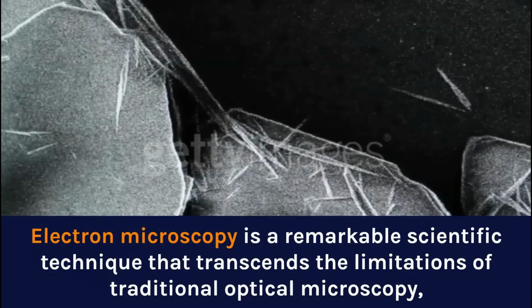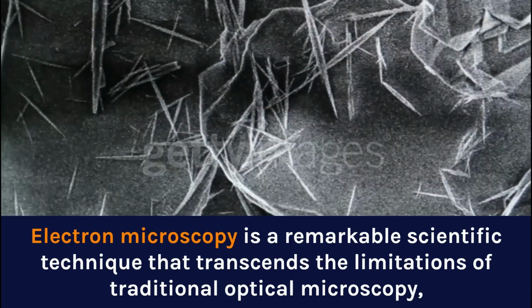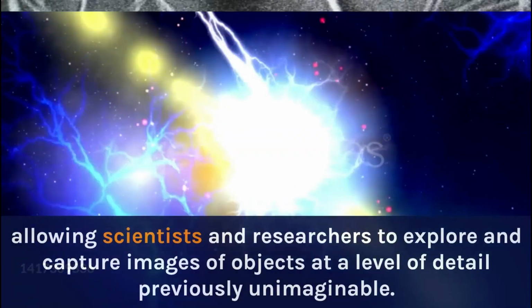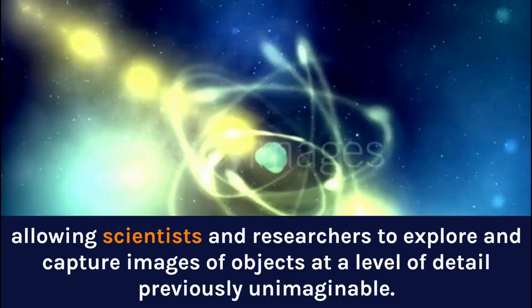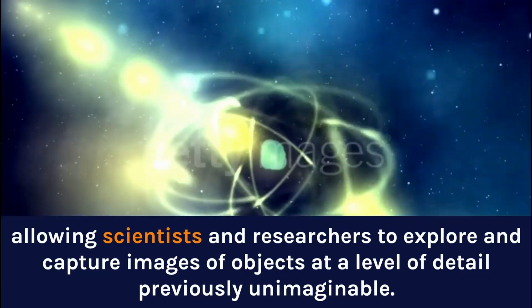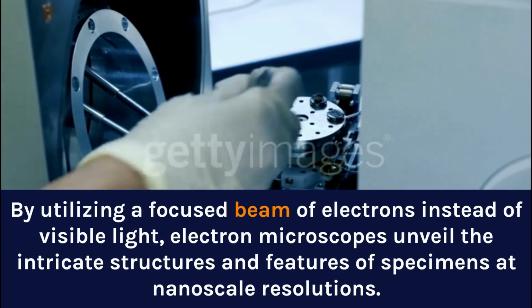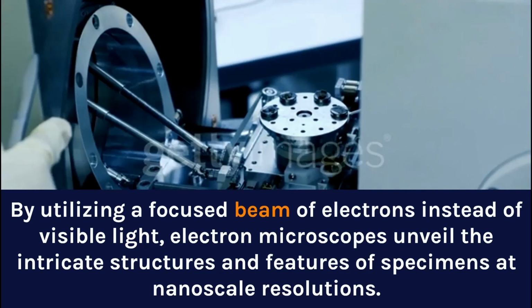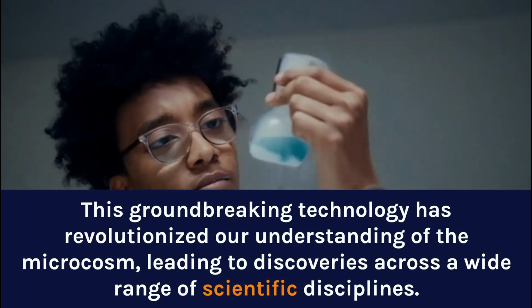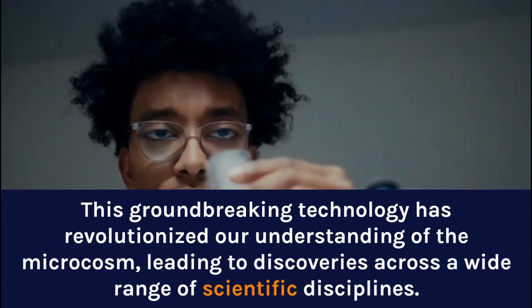Electron microscopy is a remarkable scientific technique that transcends the limitations of traditional optical microscopy, allowing scientists and researchers to explore and capture images of objects at a level of detail previously unimaginable. By utilizing a focused beam of electrons instead of visible light, electron microscopes unveil the intricate structures and features of specimens at nanoscale resolutions. This groundbreaking technology has revolutionized our understanding of the microcosm, leading to discoveries across a wide range of scientific disciplines.